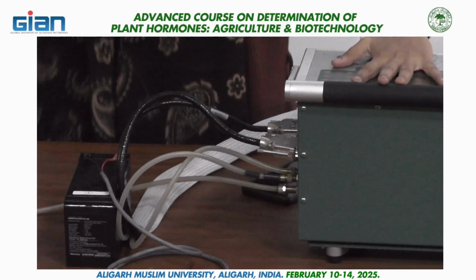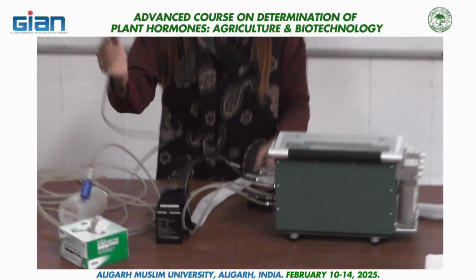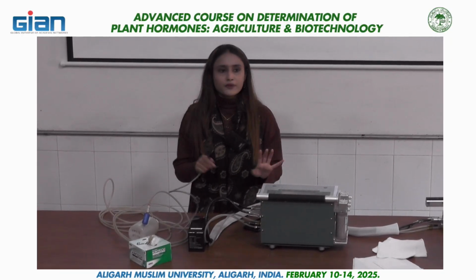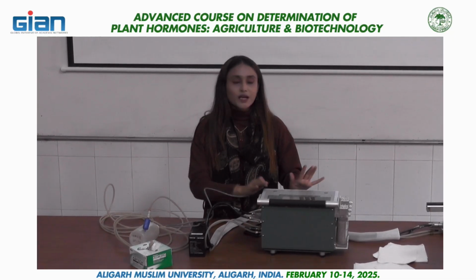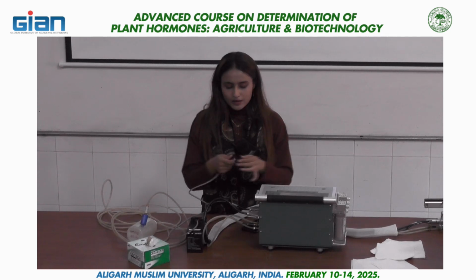As we are not doing it in field conditions, there would be hindrance in reading. Just you have to learn how to assemble it and how to measure readings from it.